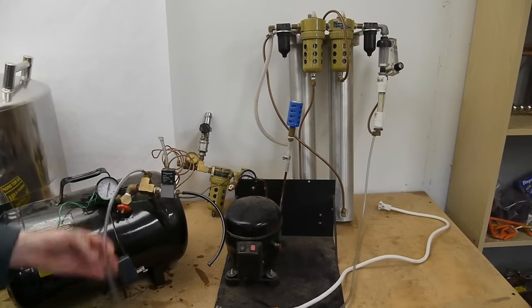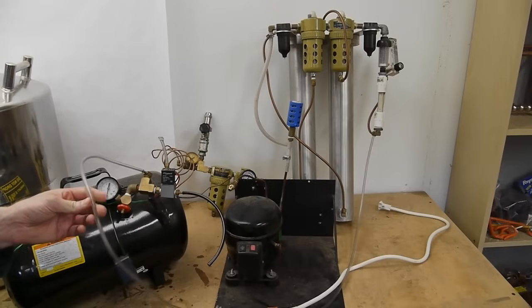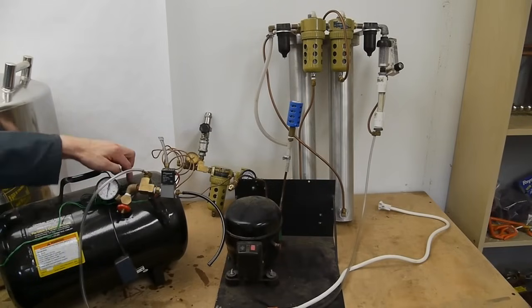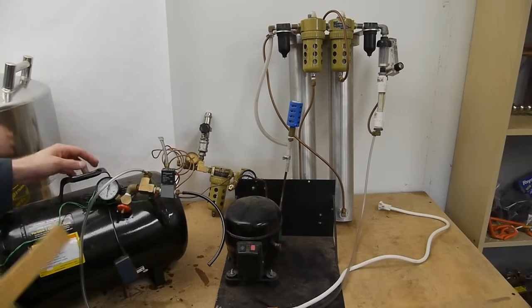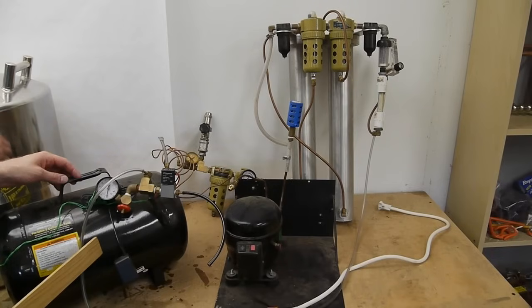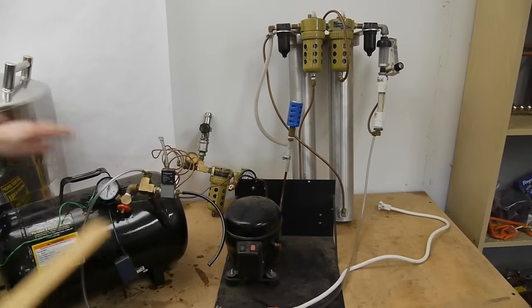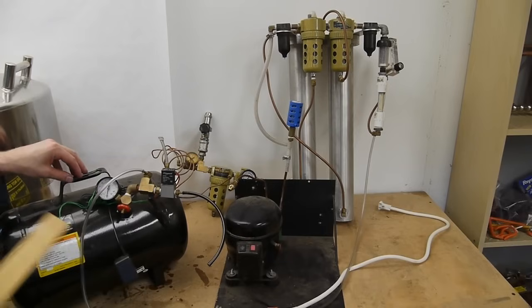So after all that the stream of about 80 psi almost all nitrogen and hopefully pretty dry comes out here and goes into the tank for storage. This tank is just a buffer, it probably could have been quite a bit smaller but it made the job easier so I could adjust the flow rate up and down and have a big buffer of nitrogen here.